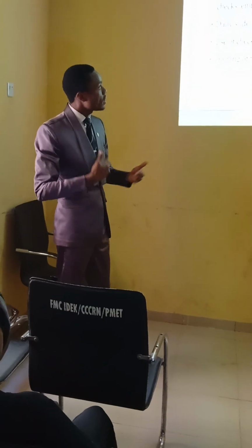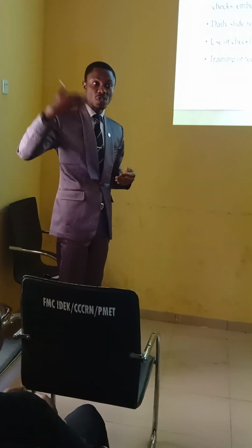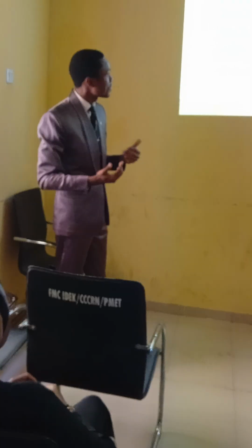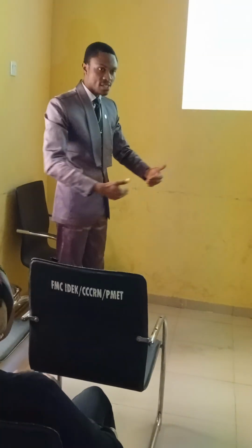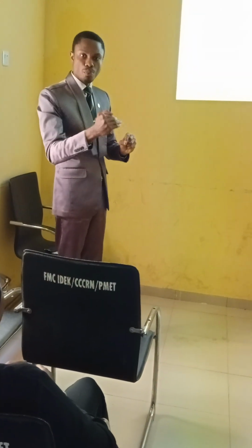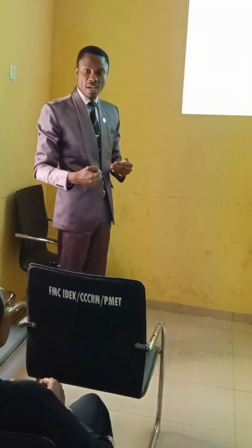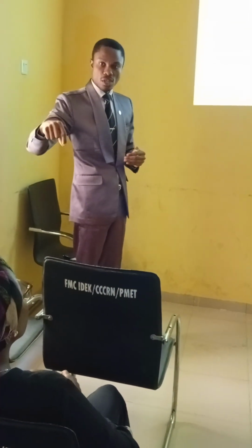Then there should be daily slide review by senior pathologists for artifact frequency, which I have observed in our lab, whereby daily our scientists do the review even before taking it to the pathologist in case of those artifacts identified. Then we can also have checklists where each of those artifacts identified can be written down, and then we point to where they are introduced, since we have seen that each step in tissue processing can introduce artifacts.